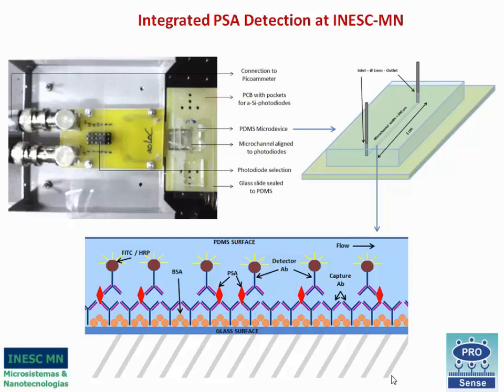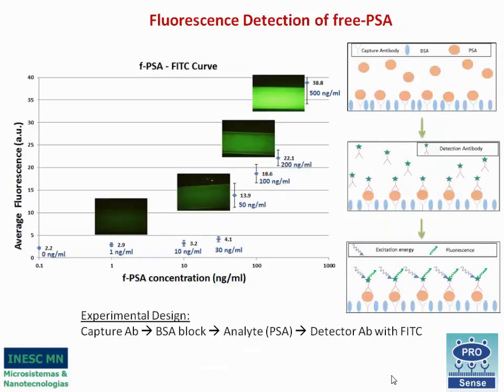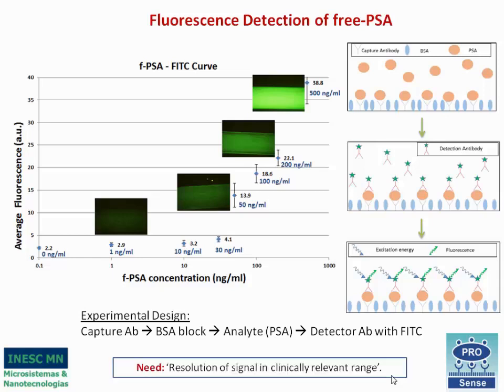It is this methodology that I will be showing very shortly, before which we see here a microscopic measurement of the fluorescent detection of the microfluidic ELISA performed. We see that though it shows an increase over a range, the clinical ranges still need to be resolved. But this is a simple methodology where we capture the antigen between two different antibodies, one of which is labeled.